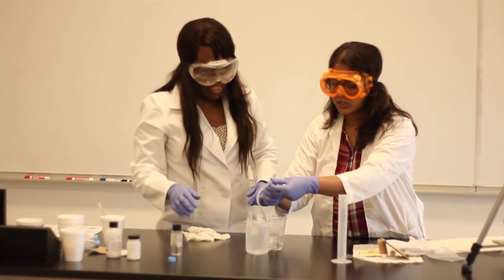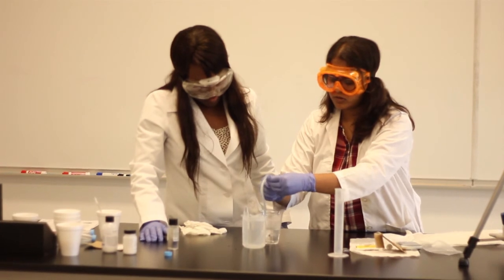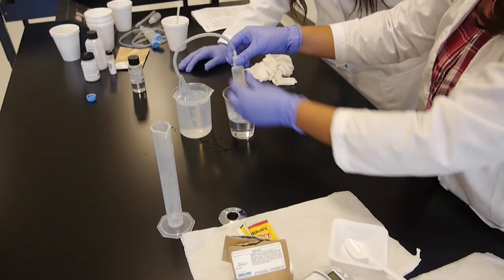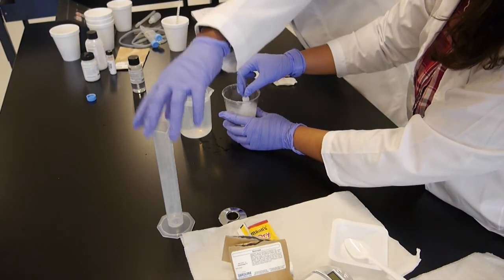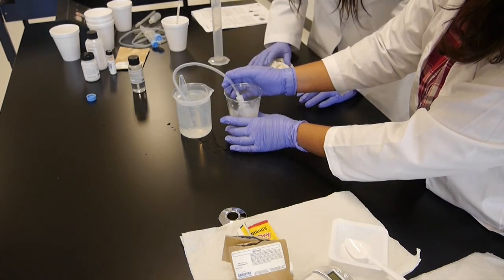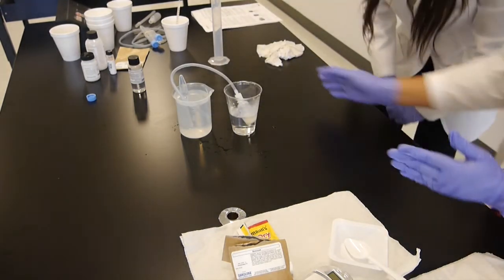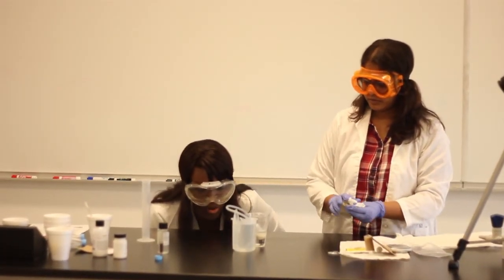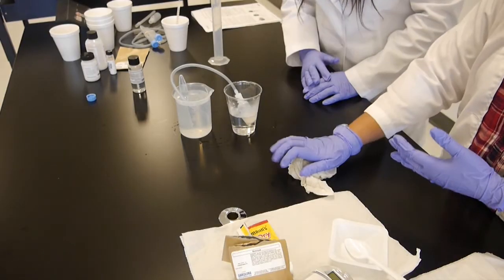Now let's attach the little lid. This has to snap on. Snap on. Completely closed. Other end of the tube goes at the dropper end. And let's put the sucrose solution in. Why we're doing this? We're doing this to keep all of the system at 35 degrees Celsius, which is around the body temperature. Yes. So the idea is once the solution is immersed in the water, the solution will have the same temperature as the water. So the yeast will be at 35 degrees Celsius. And then the gas collected will also be at 35 degrees Celsius.